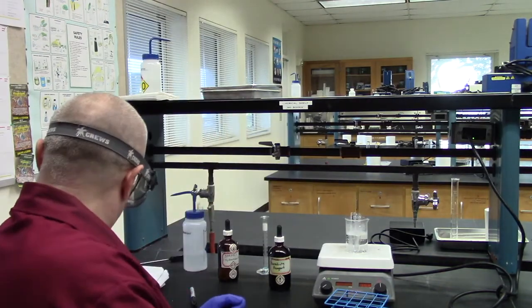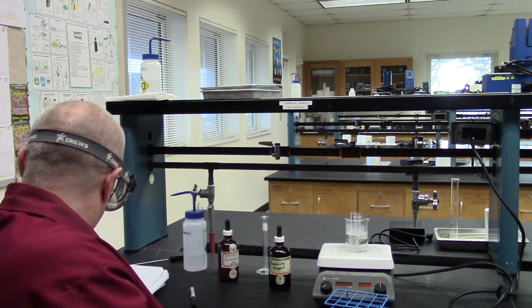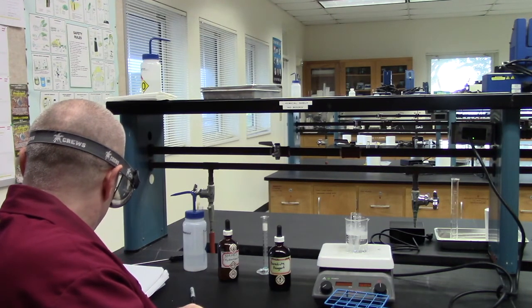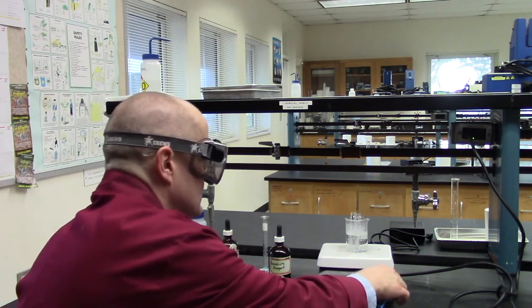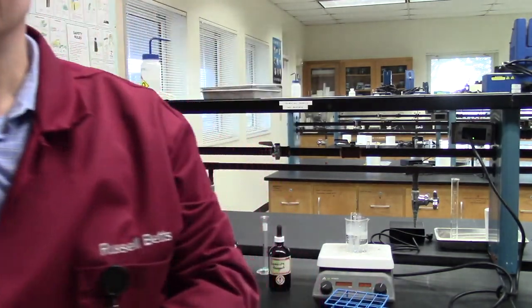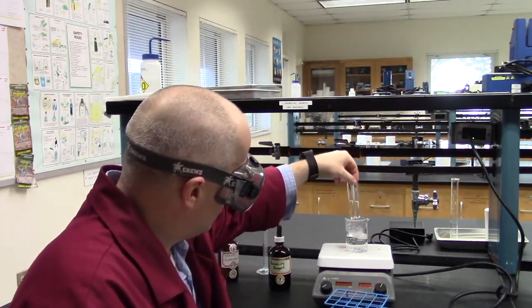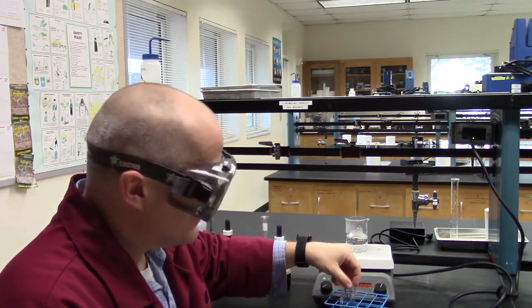I'm going to let them sit there for about 5 to 10 minutes. 10 minutes, it says. So there you go. Let's let them sit there for about 10 minutes. Let's crank that up a little more, get the water to boil. All right, guys. See you in 10. All right, guys. It's been about 10 minutes. So let's take our samples out and let them cool down for a few minutes.